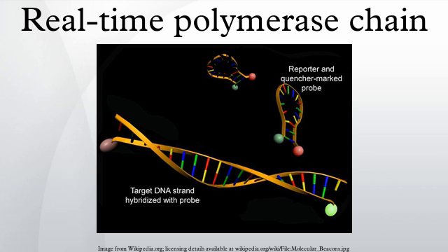Applications. There are numerous applications for quantitative polymerase chain reaction in the laboratory. It is commonly used for both diagnostic and basic research. Uses of the technique in industry include the quantification of microbial load in foods or on vegetable matter, the detection of GMOs and the quantification and genotyping of human viral pathogens.